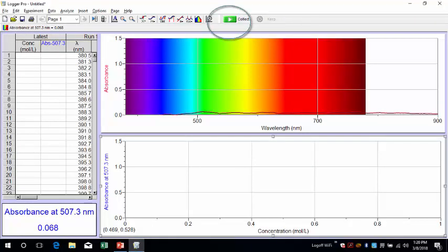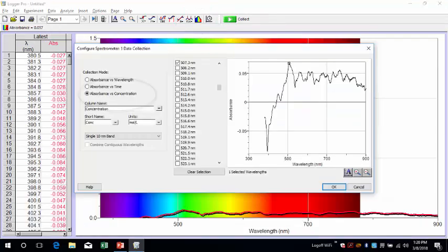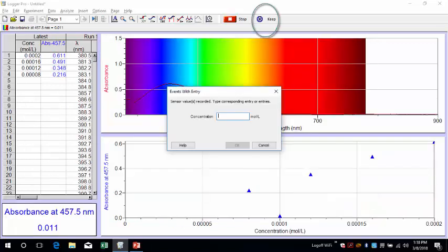At this point, it is measuring every wavelength, and we only are interested in the wavelength that is absorbing most. So now we will choose Configure Spectrometer and choose Absorbance versus Concentration. It's going to pick the wavelength where it's absorbing the most and only look at that absorbance from now on. Okay, now choose Collect, and when it becomes available, choose Keep.